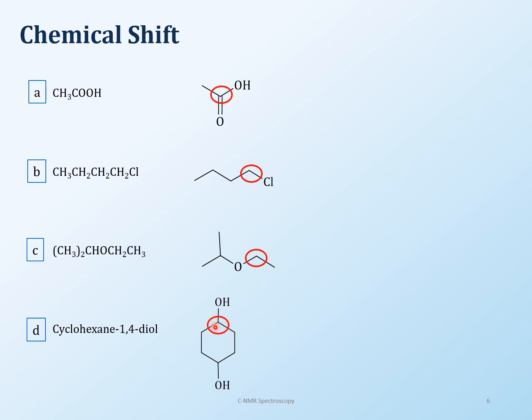Now in this case, don't forget, this is a highly symmetrical molecule. First of all, how many signals will you see for this? It would be 1 and 2. Just give yourself a symmetrical line over here. So 1 and 2, that's in the quadrant.